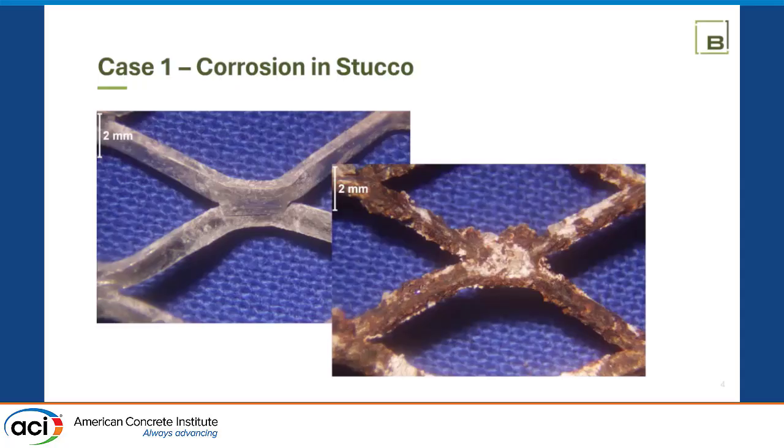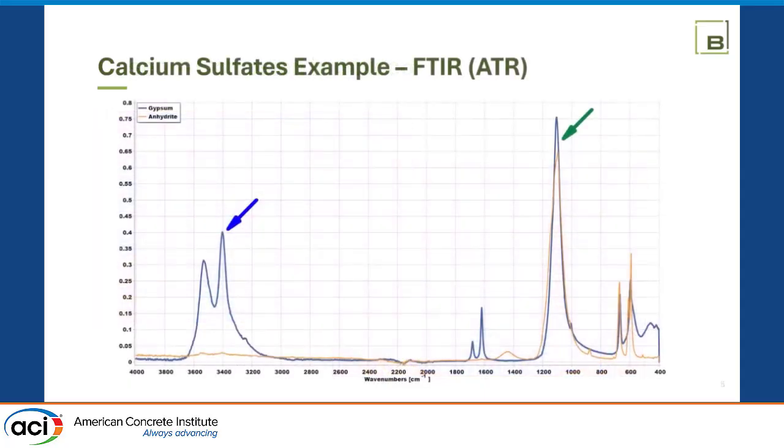But one of the things I wish I had at this point in time was a LIBS system, because I can actually, with those systems, scan these pieces and look for that zinc coating on the surface, that sacrificial zinc. Obviously, in the right image is the worst case, it's gone. But also, the LIBS gives you a wonderful technique of doing tunneling, where you can keep zapping the same spot over and over and bury yourself into it and find out where that zinc is gone, which provides some nice information to the evaluation.